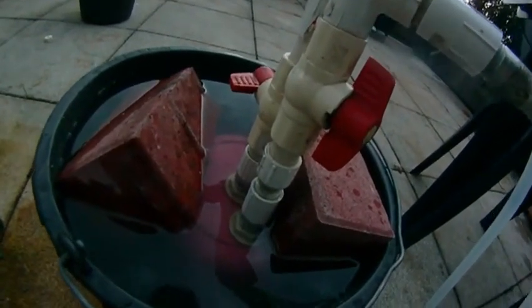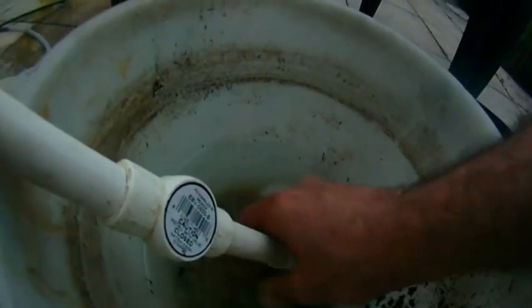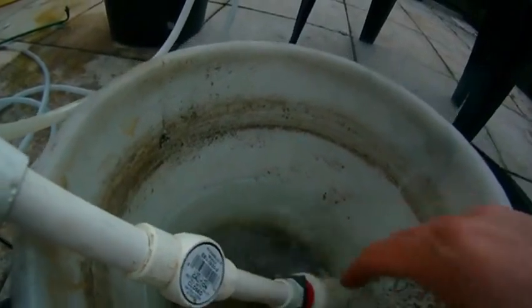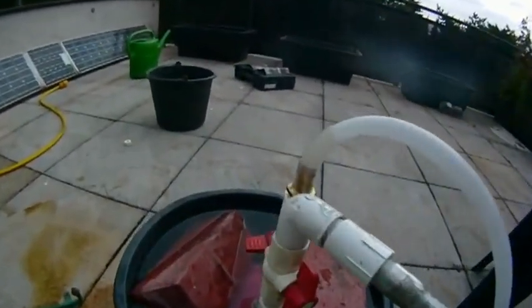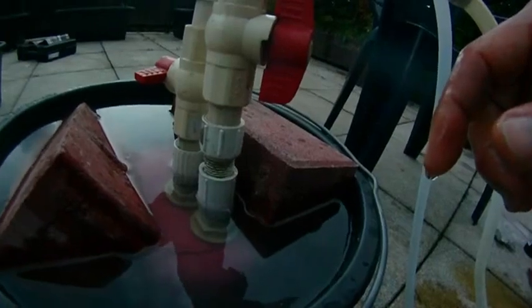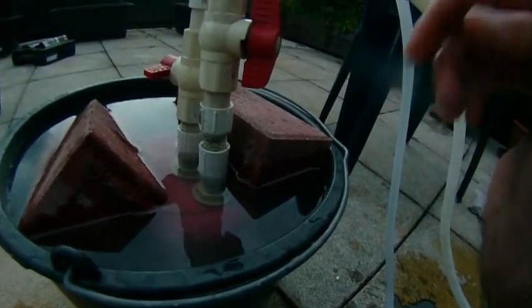You can hear it going bloop bloop bloop. We are getting hydrogen being evolved from here. You start to see the water level rise here as it collects in the pink bucket, which is inverted down there. Because this valve is closed, the gas is flowing in. The water is being displaced from this bucket, pushing the water level up. Then we'll know that we've collected enough hydrogen to flare off.